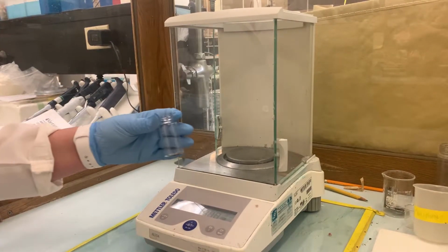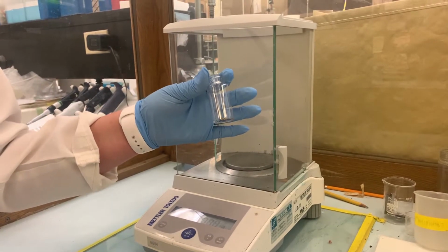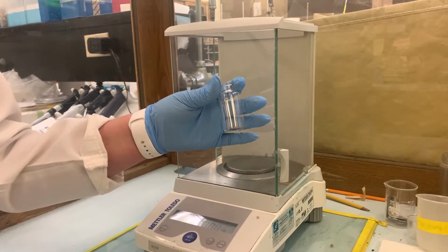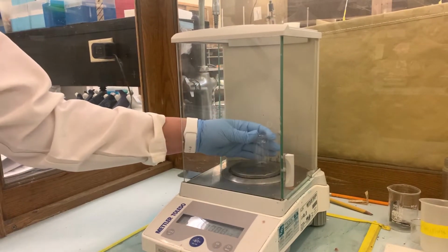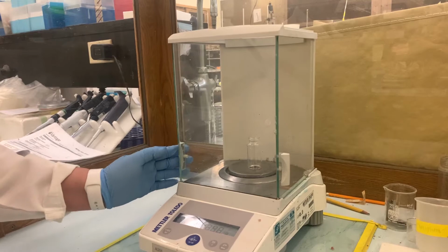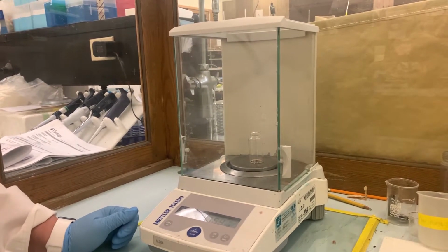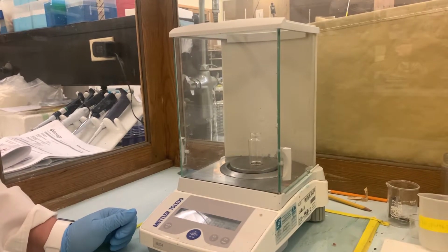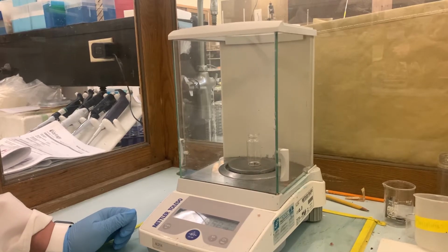In the end, to measure the total lipid content in this vial, first we take the vial, measure it to see how much the vial weighs itself, add in the wet lipid content, dry it in a heater, and then we put the vial with the lipid onto a scale and we measure it. Typically, the lipid comes out to be anywhere between 0.15 and 0.2 grams.